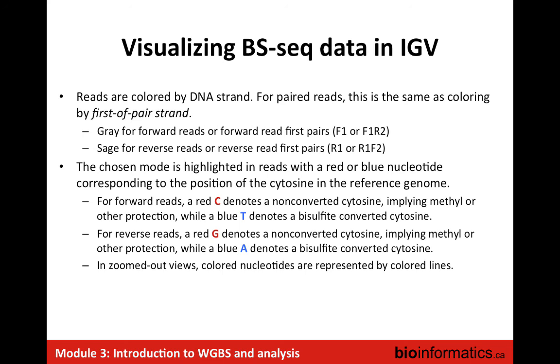So I sort of lied. This is another part that I find a bit confusing and challenging, which is the way these reads actually get displayed. In the browser that we're going to use, the IGV browser, it's quite nice because it has a specific function to display bisulfite treated reads. Again, in the practical, I think we'll see that. If the reads have been mapped using Bismark, using the neat trick, but you look at the raw reads on the reference, you'll see mismatches everywhere. So if you didn't know that this was bisulfite treated, you'd say, what are these reads?